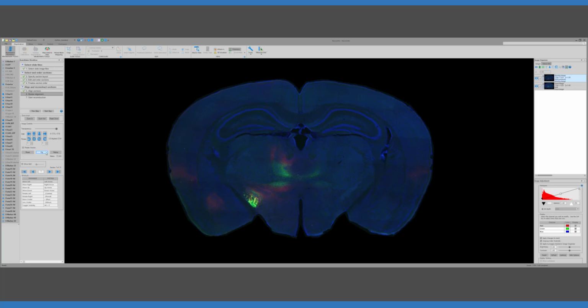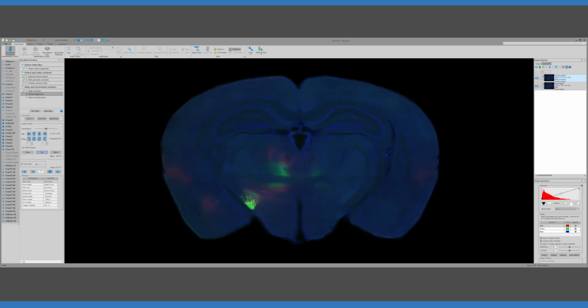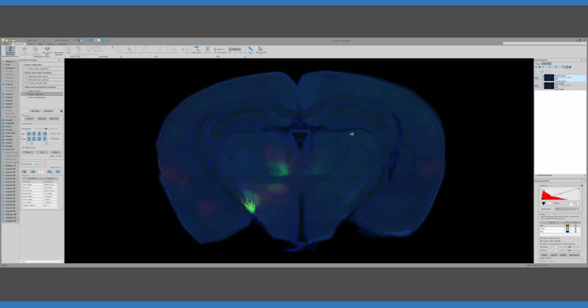Now, using the alignment process that's the most accurate, this is often taken care of. When there's clear labeling that's more on one side of the brain than the other, it's fairly trivial to do that, and we can see. But oftentimes when it's more subtle, it uses things like blood vessels and the shape of different structures. But it is truly using all of the fluorescent signals available to do this. Yes. Yeah, so in this case, we get that flipping right every time.